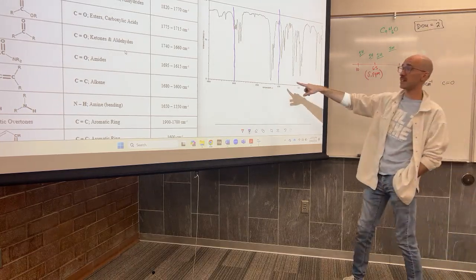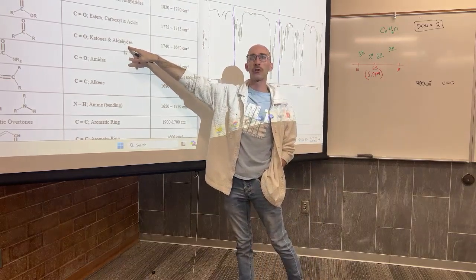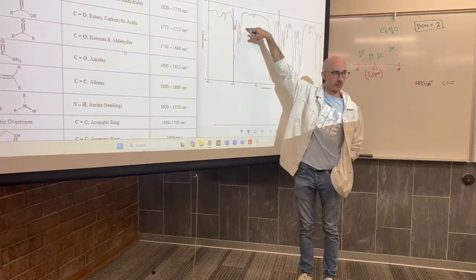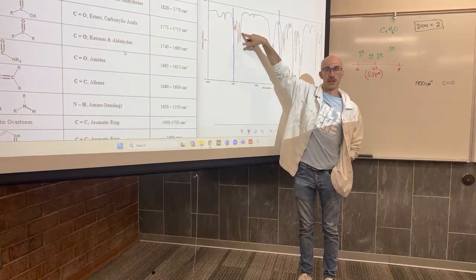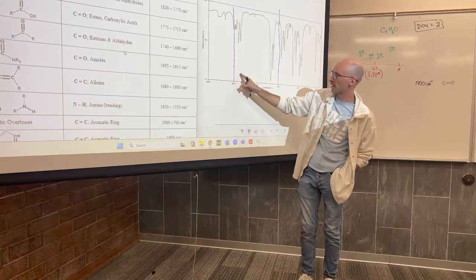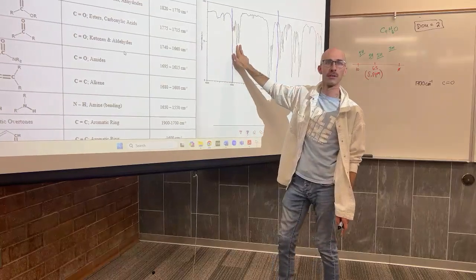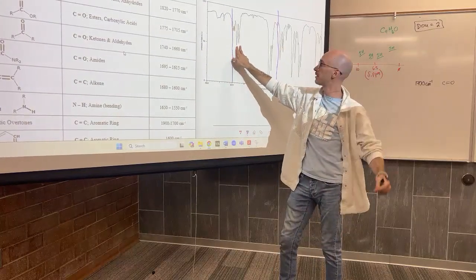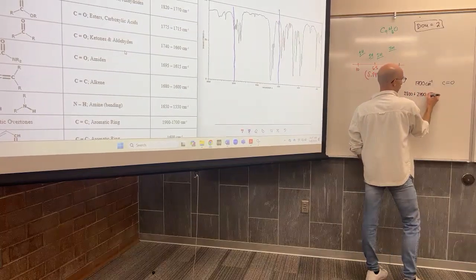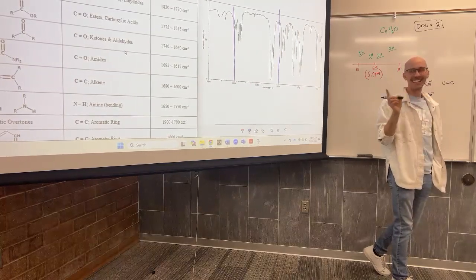Great idea. If this is the CO double bond of an aldehyde, we should see a corresponding peak. We also should see a corresponding peak if it's a carboxylic acid. And I think you guys know that those carboxylic acids look real ugly. And there's nothing ugly about this. So as you look at 2800, here's 3000, 29, 28, 27. I'm going to follow 28 and 27 all the way up. What do you notice? 2 peaks, twins, at 2800 and 2700. That agrees with my correlation table. To give me what? No, not an aldehyde. The CH of an aldehyde. Thank you.